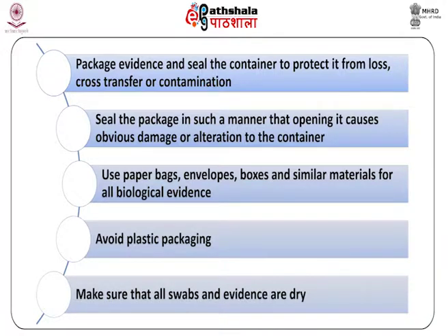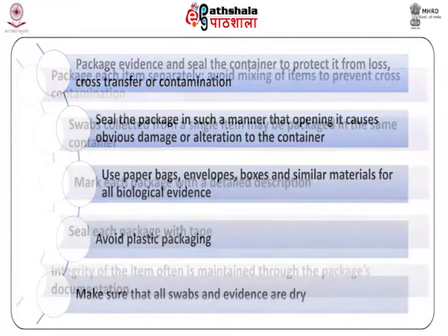Seal the package in such a manner that opening it causes obvious damage or alteration to the container or its seal. Use paper bags, envelopes, boxes and similar materials for all biological evidences. Avoid plastic packaging. Make sure that all swabs and evidences are dry.